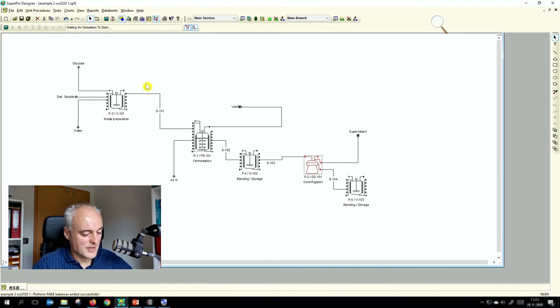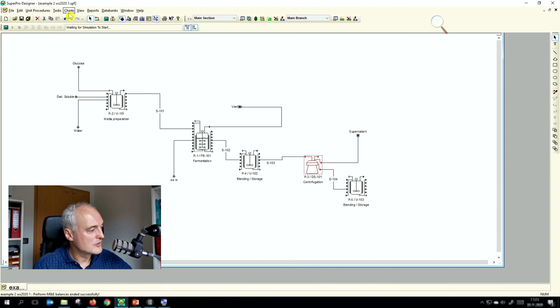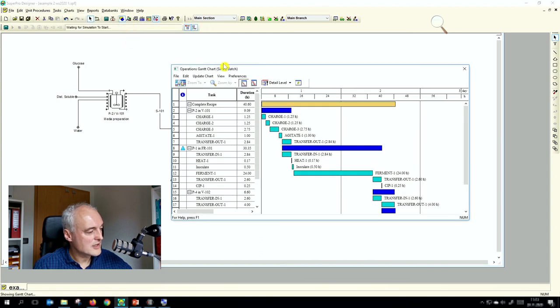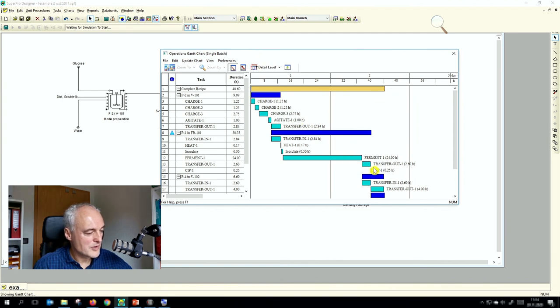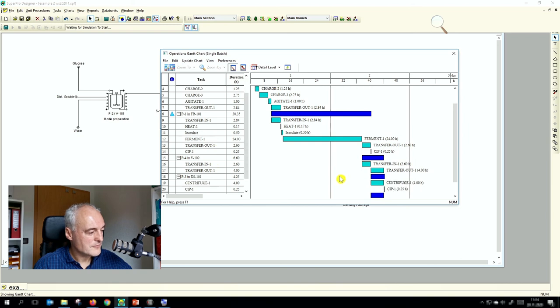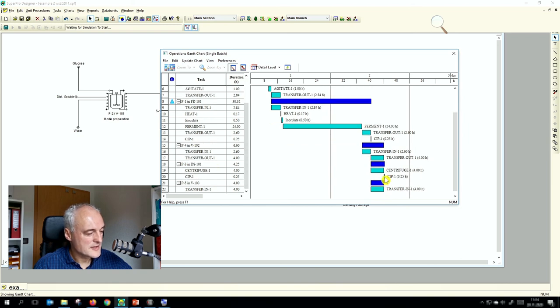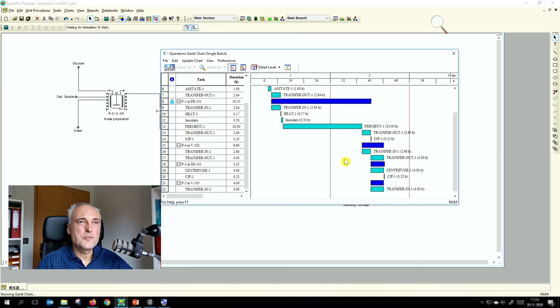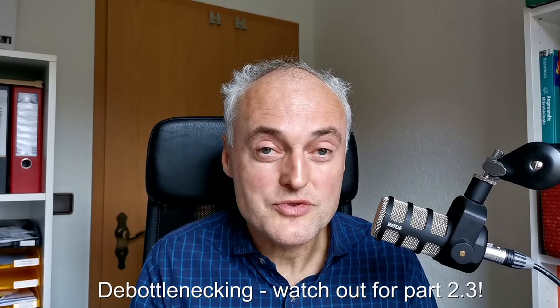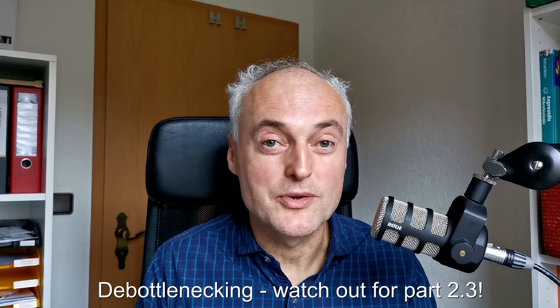In the Gantt chart, we now see a small SIP operation added at the end for both the fermentation unit and the centrifuge. The SIP skid can only operate on one unit at a time and then switches to the next. Now you know how to schedule operations and add downstream units — go and build your complete process. Have fun, thank you, and goodbye.